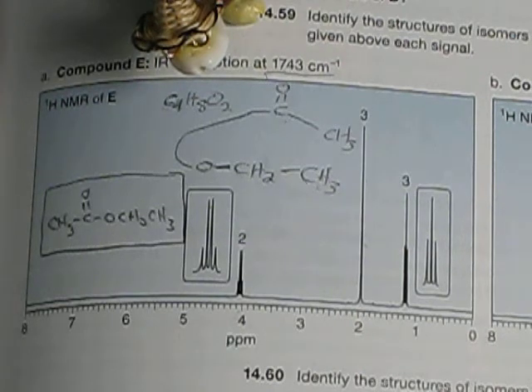By the way, on our instrument, proton NMR is going to take me about a total of about 1 minute to run it, and then about, because I've done it so much, 1 minute to process a spectra. So in less than 10 minutes, I've gone from finding this powder on the benchtop, not knowing what it is, to finding out what it is. I've got the exact structure of it right there.